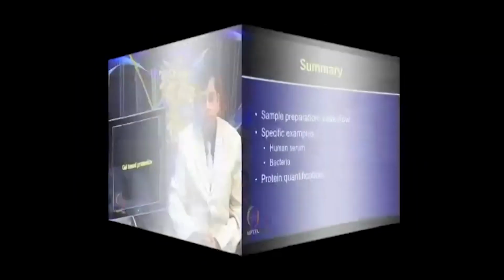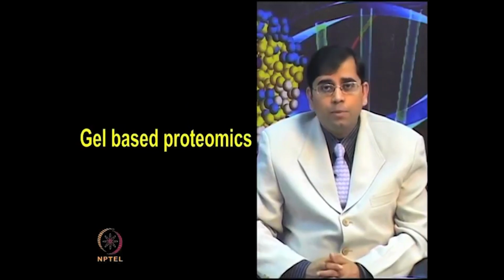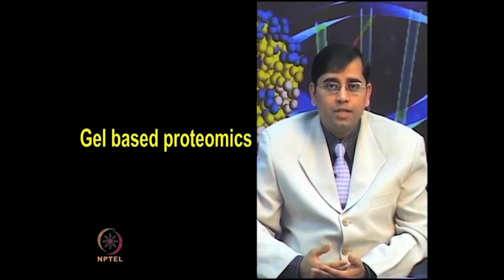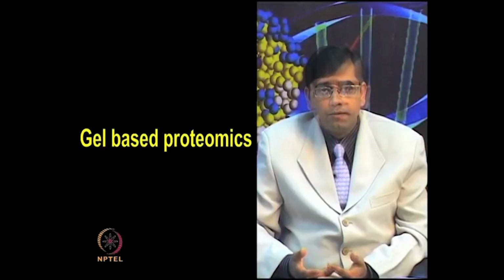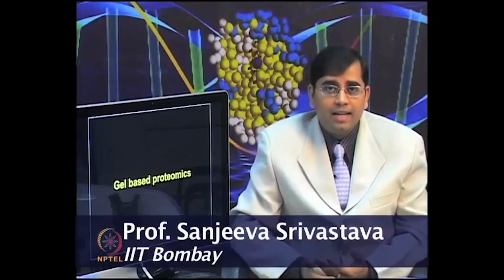So, we will continue our discussion on proteomics, and now since you have prepared a good sample, it can be used either for gel-based proteomics approaches such as two-dimensional electrophoresis, or for gel-free proteomic approaches such as mass spectrometry. We will continue our lecture on gel-based proteomics and then demonstrate how you can use your prepared sample further for analysis of complex proteomes such as serum proteome, bacterial proteome and plant proteome.